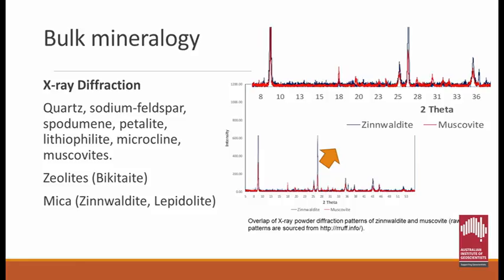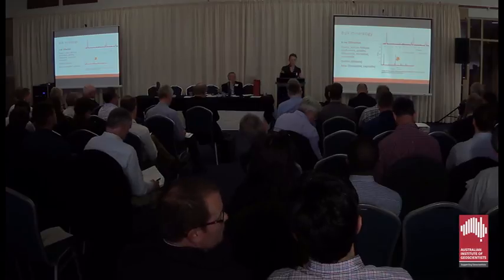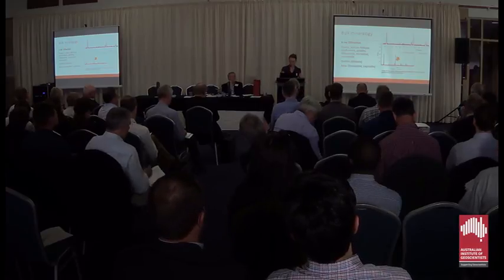There are some like clays or like micaceous lithium-bearing minerals that would not be fully resolved in X-ray diffraction, and that's on the right. Basically, what I'm trying to show is that zinnwaldite, for example, overlaps with the standard muscovite peak. So laboratory would generally report it as a part of the illite-muscovite group, and to understand which mineral it is, you need to do a more detailed microscopic analysis.